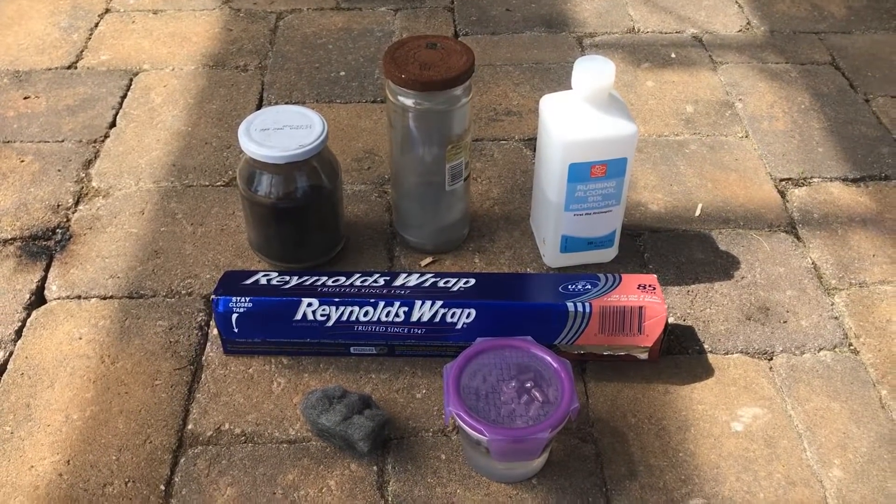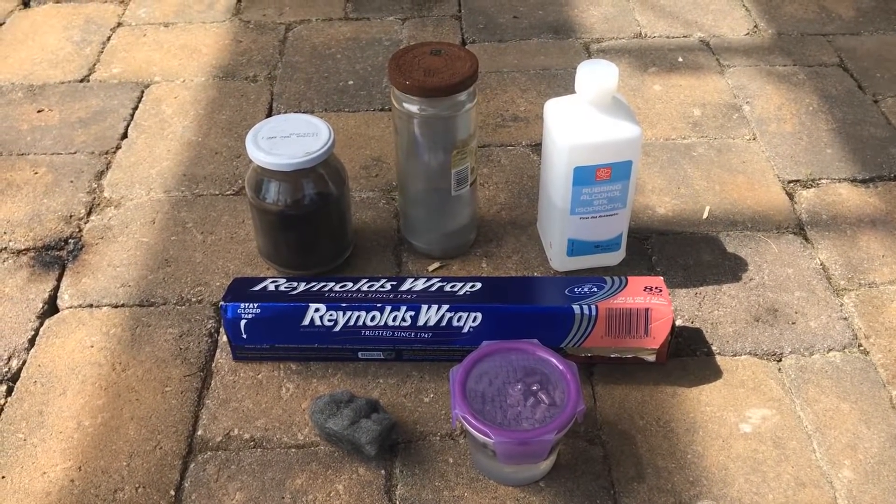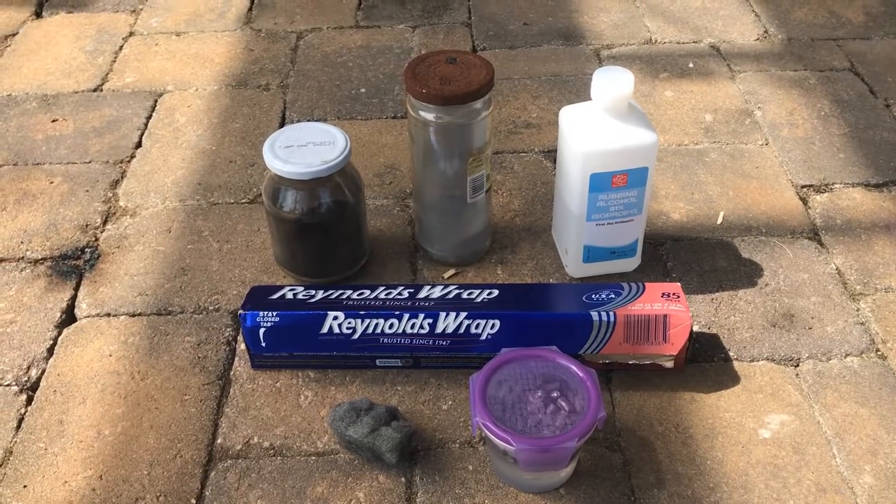Today we're going to be reacting carbon, aluminum, isopropyl alcohol, steel wool, and lithium metal with bromine.